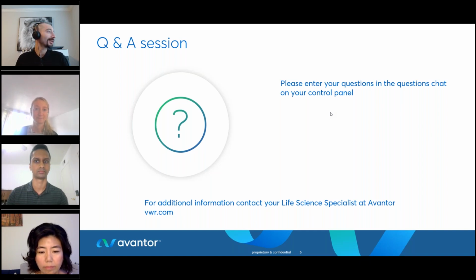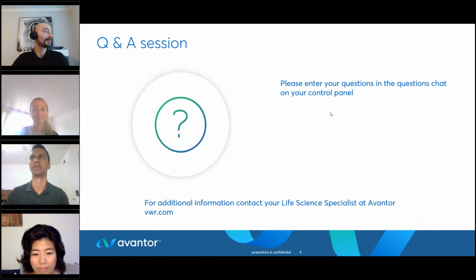Aaron, maybe you can take the next one. May I use the kits for metagenomics plasmid sequencing, and will Epi2me support that approach in the future? I can take that one. So the workflow we described in this webinar is more suited for de novo assembly.